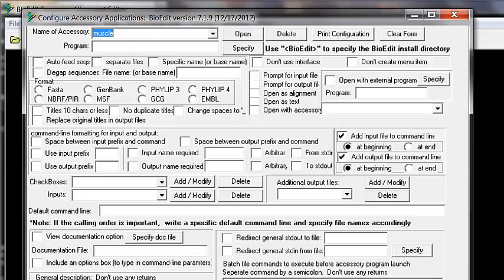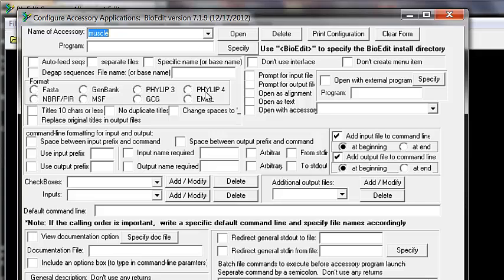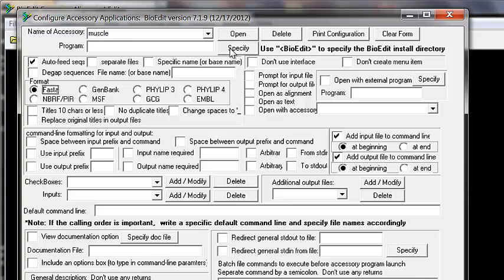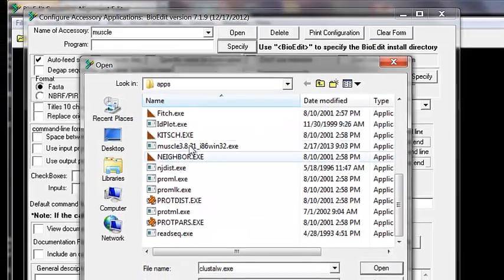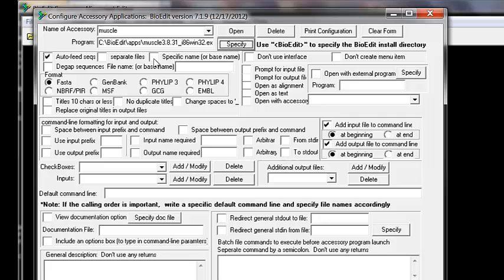Now let's go back to the BioEdit Add Program menu and select the options we want MUSCLE to get from BioEdit. First, we want to auto-feed the sequences so we don't manually save a file — we want sequences fed automatically in FASTA format. We also need to specify where the program is: click 'Specify' next to Program, and it takes you directly to the Apps folder where you can select the MUSCLE executable.